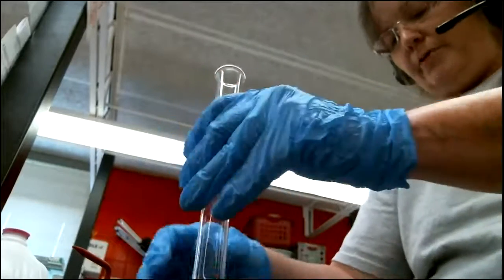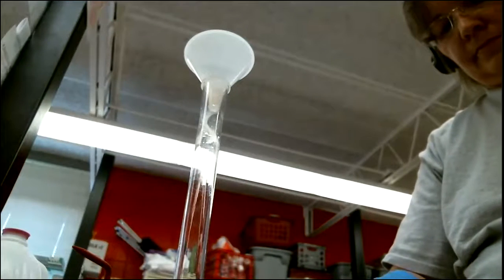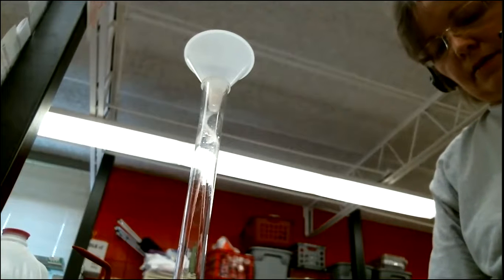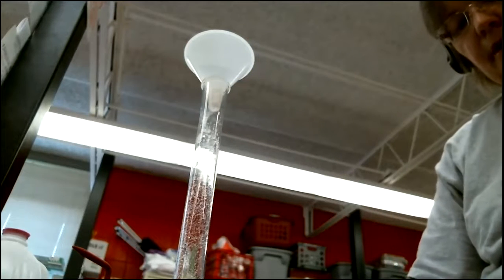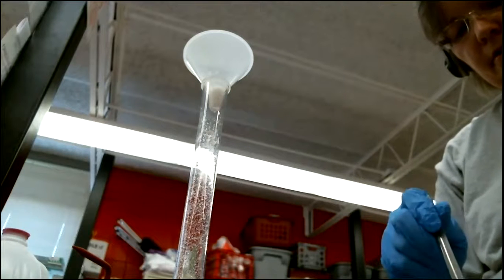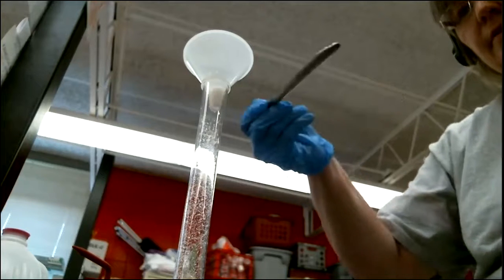So I'm going to try to put some more salt in here. I'll use the spatula. I've got a wide mouth funnel, so it kind of channels everything well. I've got some chunks of salt that are making it a little bit harder.